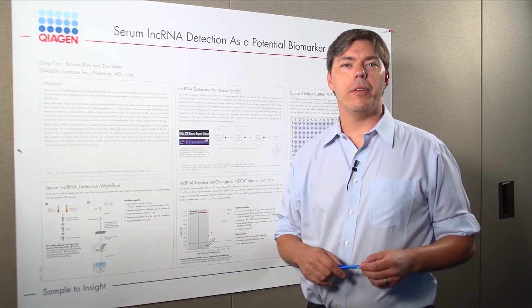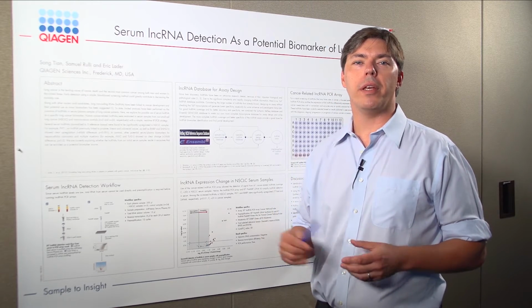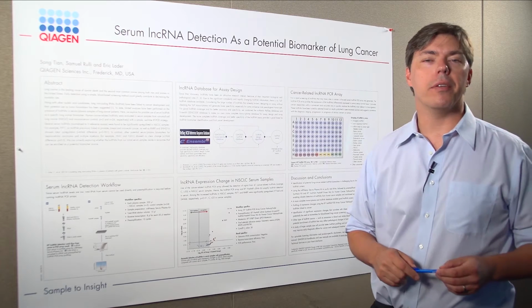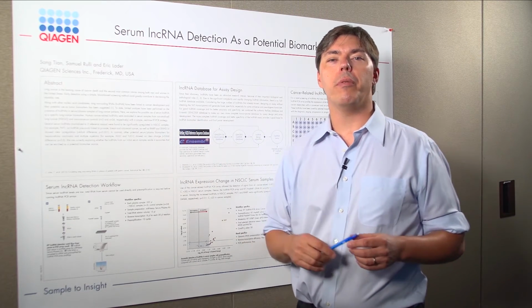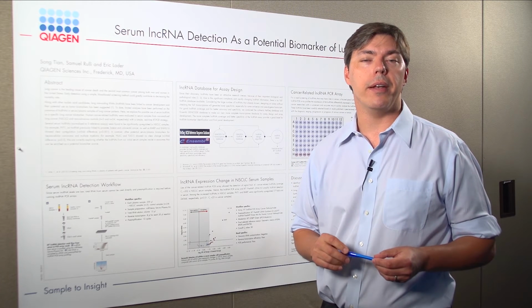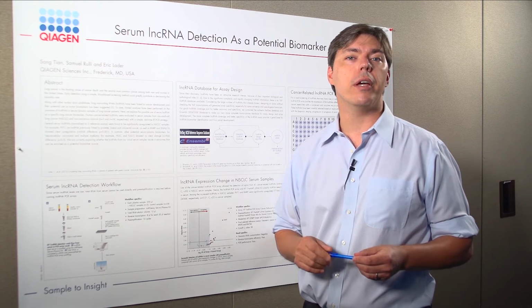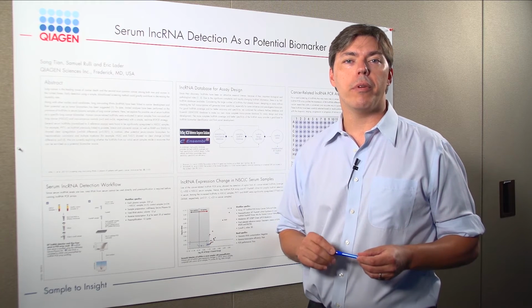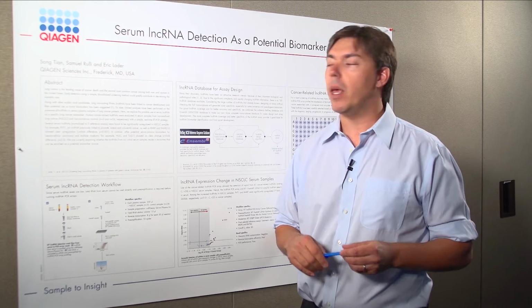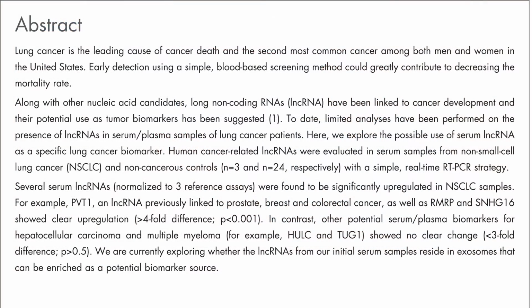Hi, my name is Sam, and this is our poster presentation on evaluating serum long non-coding RNAs as potential biomarkers for lung cancer. In this study, we developed tools using real-time PCR-based technology for identification of cancer-related long non-coding RNAs, as well as developing a new database to design our qPCR algorithm. We're comparing 3 samples from non-small cell lung cancer patients to 24 normal individuals.